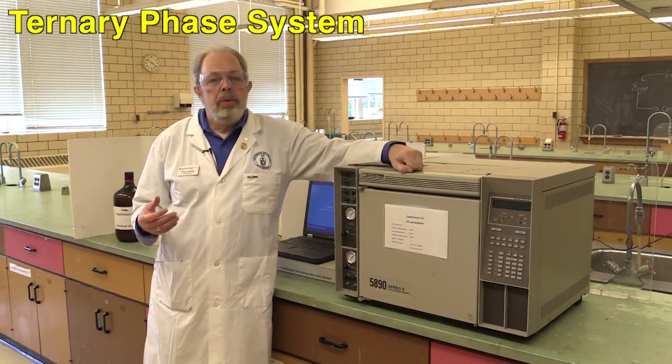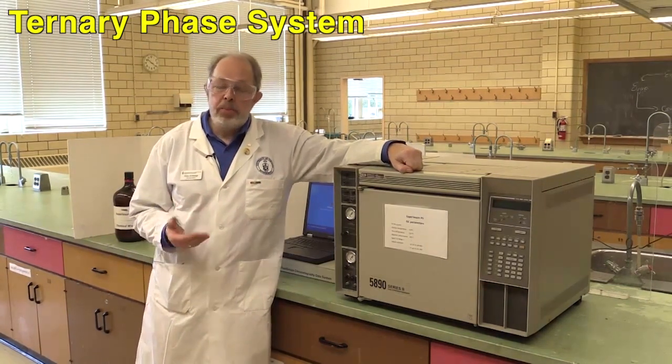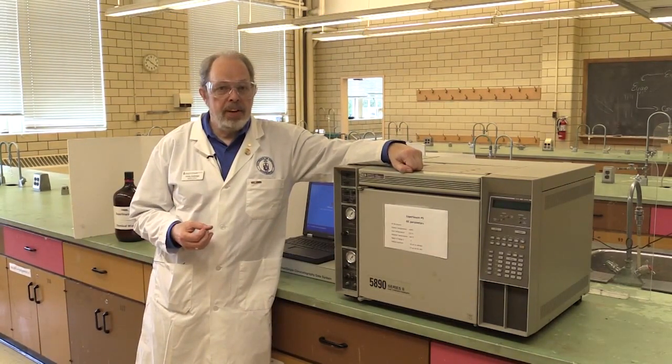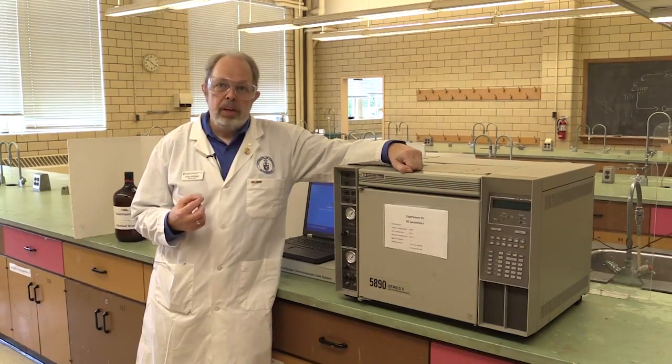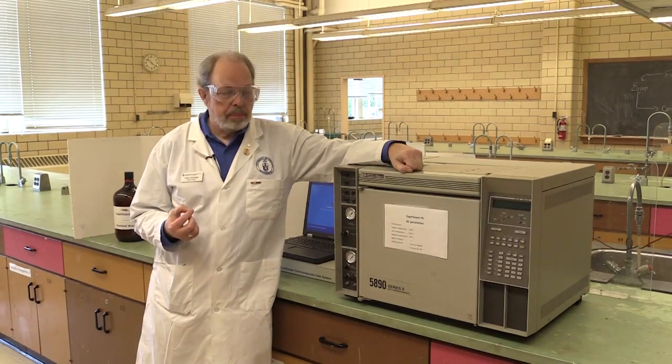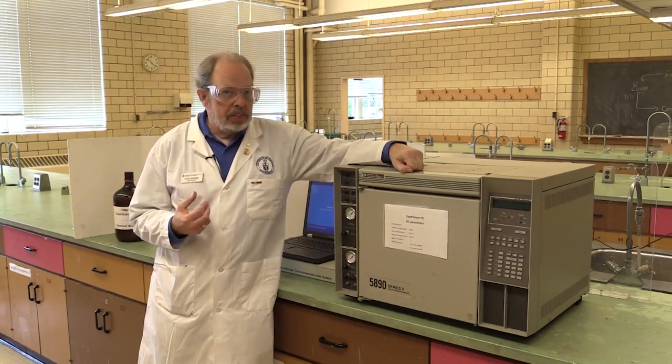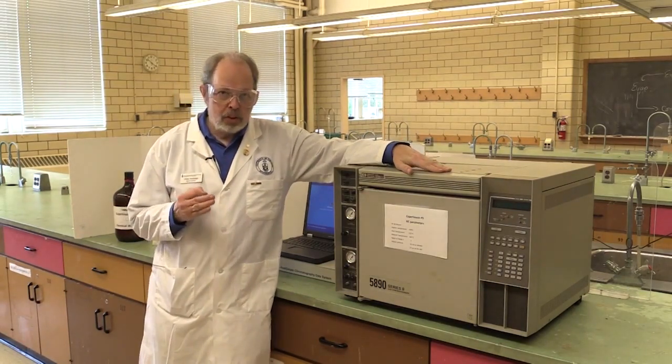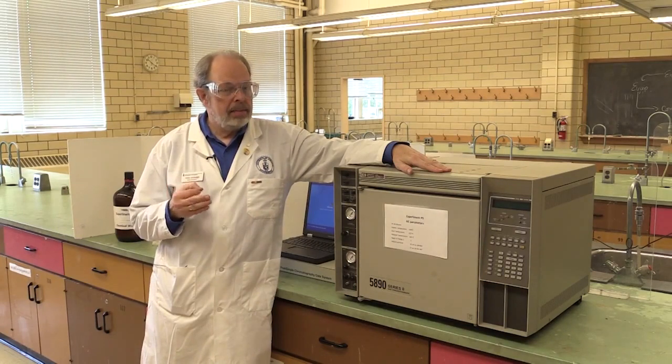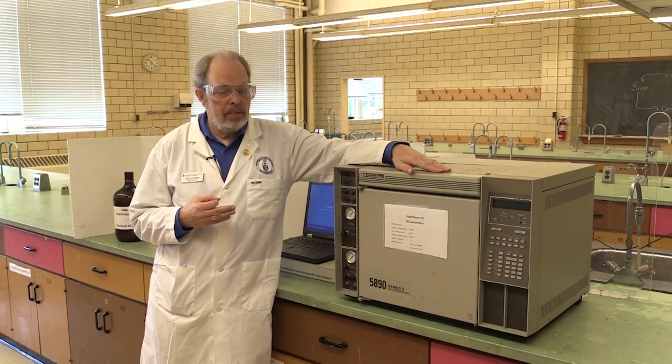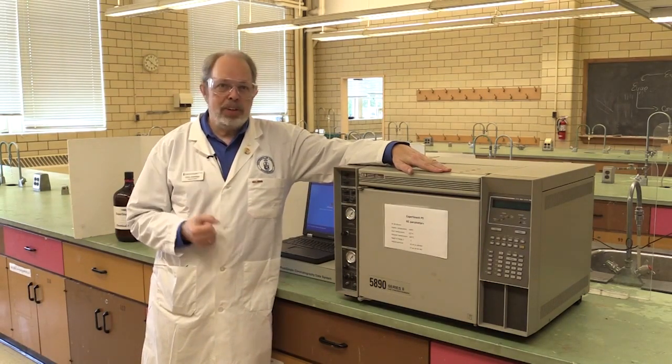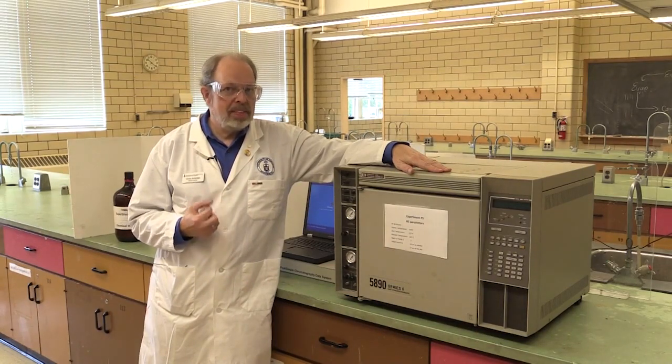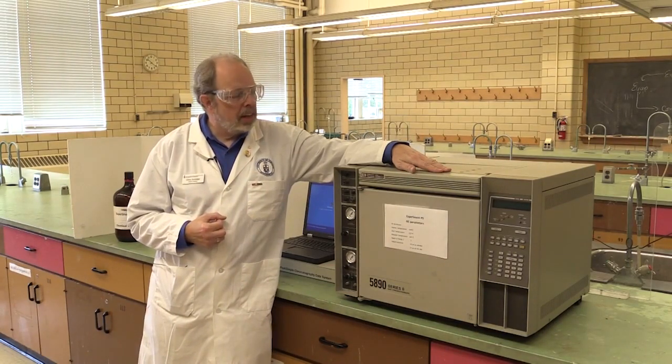This video shows how to operate the instrumentation for experiment P5, which is a ternary two-phase system with three components. This instrument is a gas chromatograph. You're going to be analyzing using a gas chromatograph. You've sent samples for gas chromatography last year, but this time you'll actually use the machine yourself.